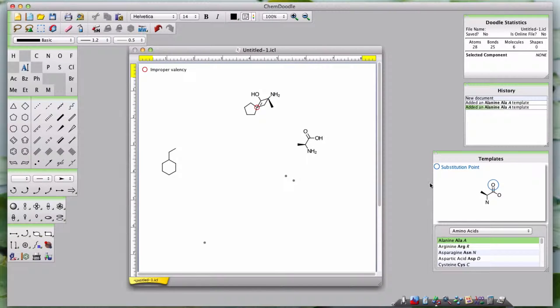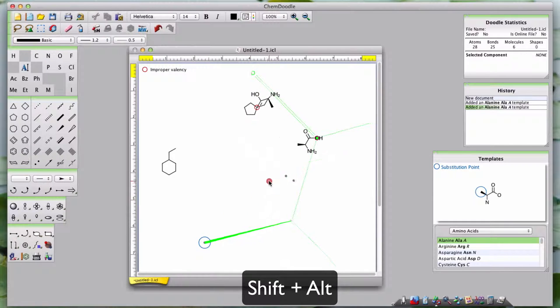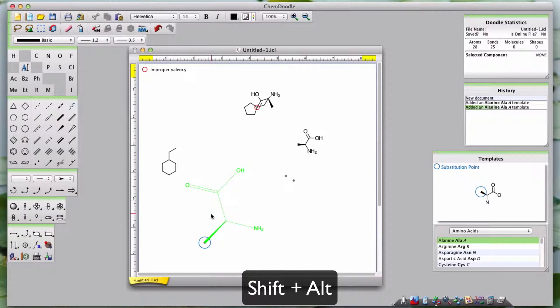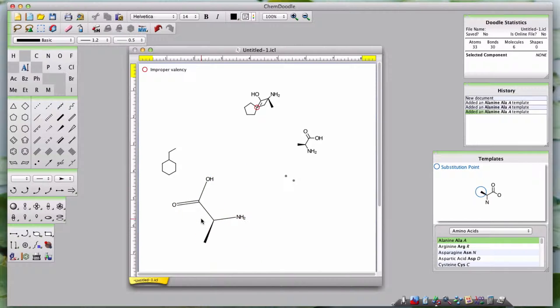It is easy to avoid these situations as you can take advantage of the Shift and Alt modifier keys to toggle the size and angle of the template, just like with bonds and rings. This will allow you as much flexibility as you need to place your chosen template the way you want.